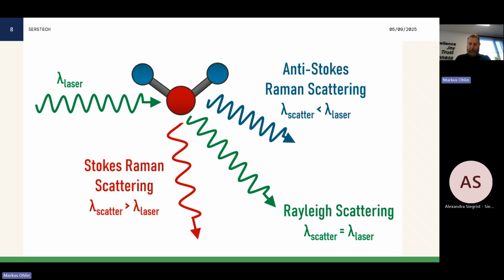What we're interested in is the radiation that comes back at a higher wavelength that has shifted. We call it a Raman shift or a Raman scattering. And that is the light we want to collect and analyze to see the fingerprint signature for a specific molecule. And mind you, it's a very small amount of that light, so it's a very inefficient process.